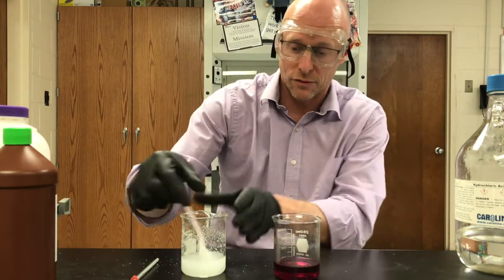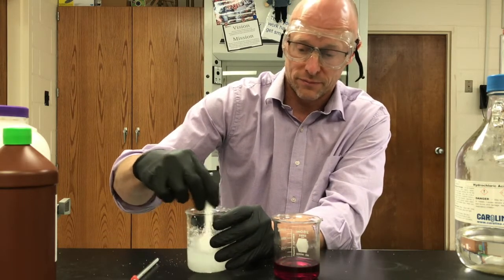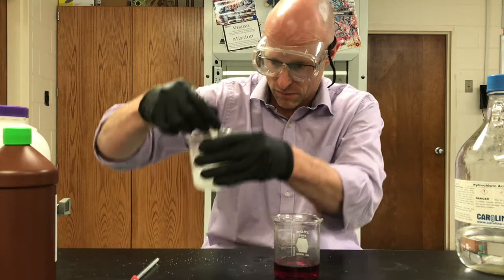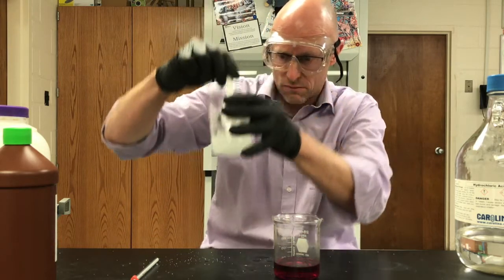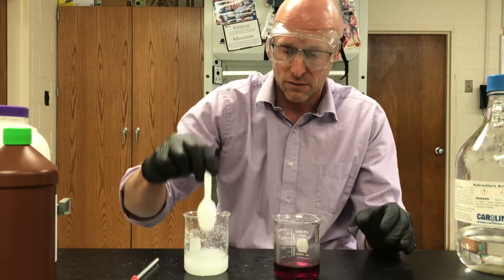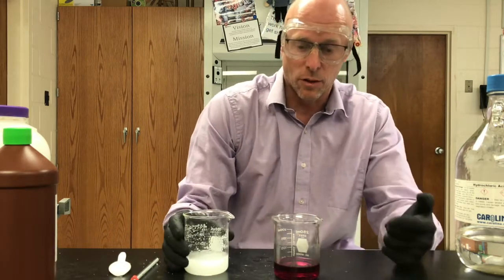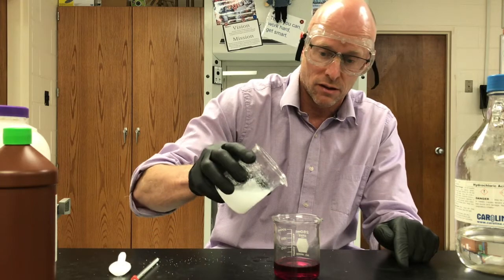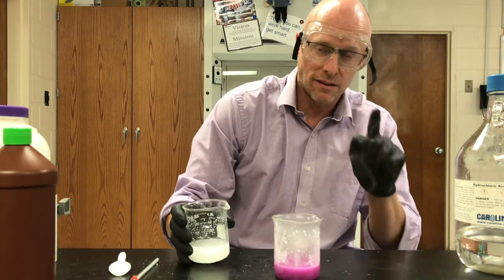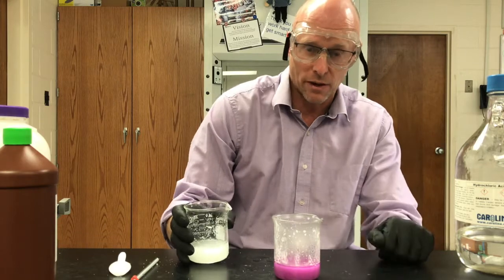I've got goggles and gloves — that's definitely important; I don't want to get any of this on my skin. I want you to listen and observe when I put the base in the acid. That is an exothermic reaction — immediately the water is actually boiling. I got some acid jumping out there.